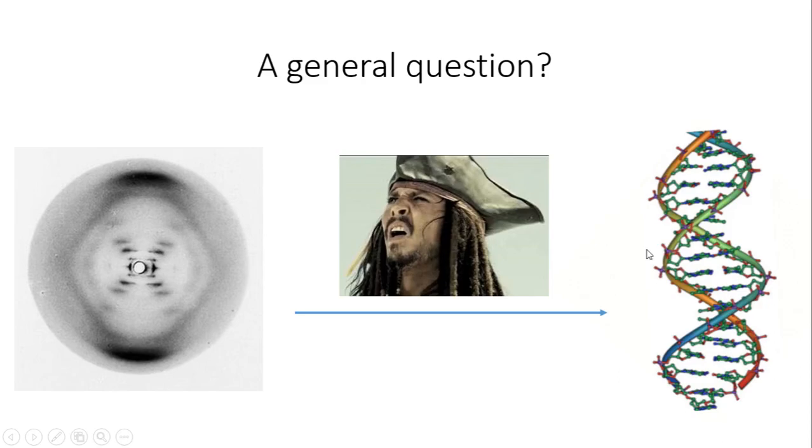Okay, so the thing is that the structure determination of any macromolecule, be it a nucleic acid like DNA, RNA, or even protein molecules, doesn't usually begin with this diffraction pattern. There are some steps that happen before this diffraction pattern as well.